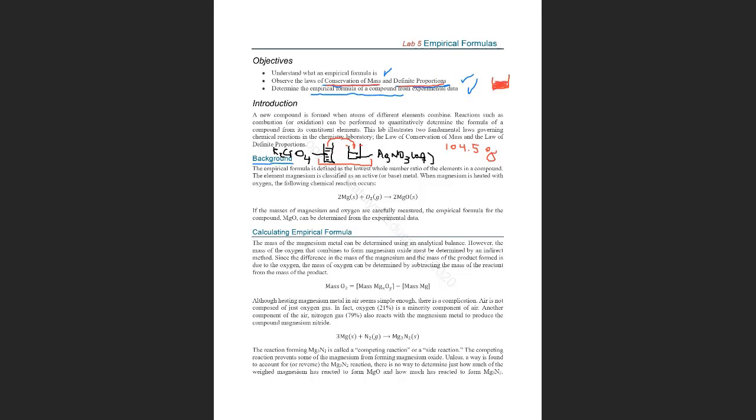A solid is an indication of a chemical reaction. The solid is actually silver chromate. So I see evidence of a chemical reaction. Now I will wait again. After the chemical reaction, I will place it on the analytical balance, or any balance, and I will take the weight.